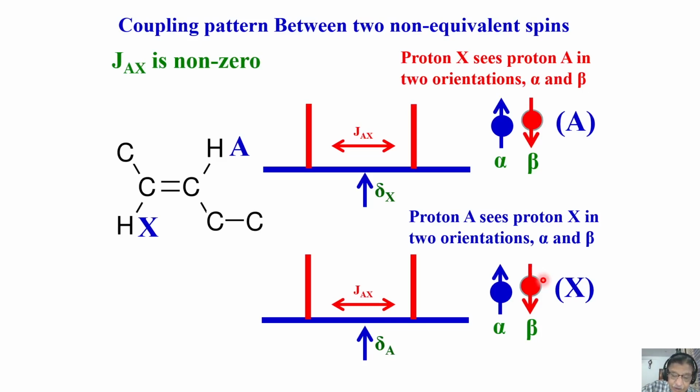What I will do is more about the multiplicity pattern for other spin systems. I am going to start that tomorrow, but today I will stop at this point. We have understood quite a bit about scalar couplings today. Now we have come to the level of interpreting the multiplicity pattern. I just took the example of some hypothetical molecules which you worked out from the energy level diagram, and now I am telling you how the spectrum comes. With this, we go further.